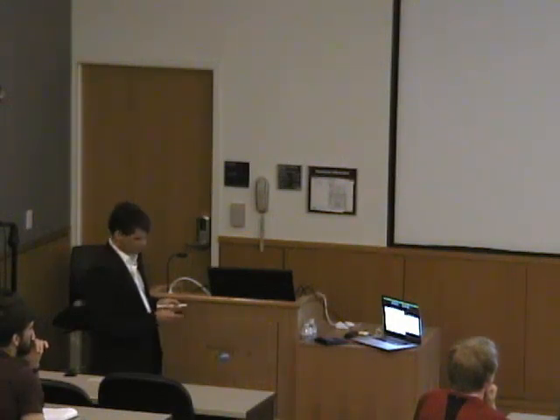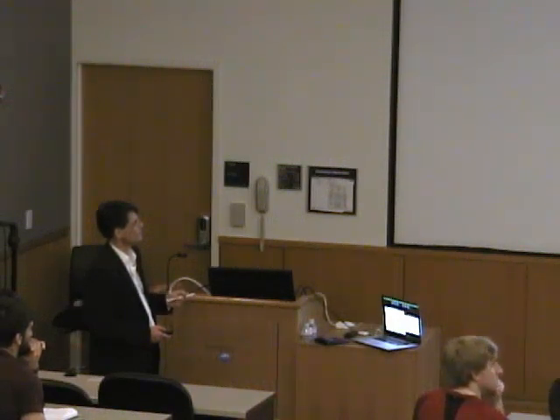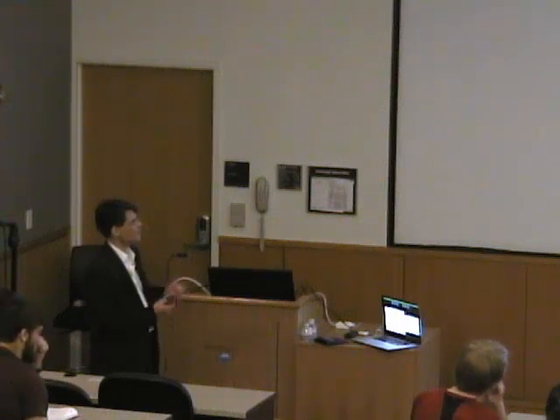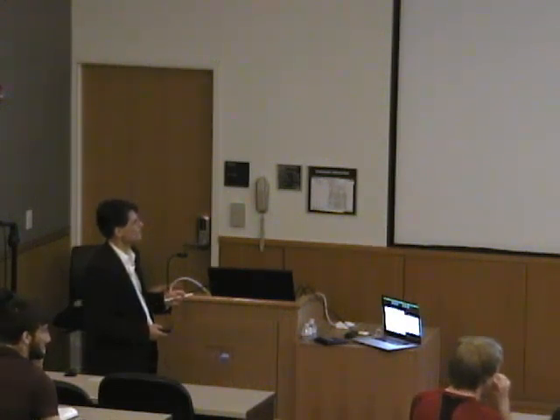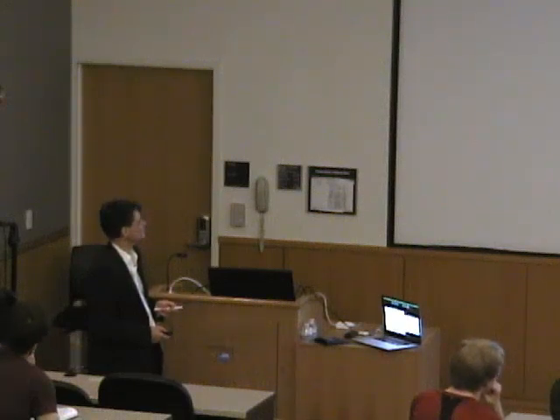And there is a second class of MCD spectra, where the MCD spectra dominantly consist of opposite signs. In this case, there is dominant spin-orbit coupling in the excited states of the system that gives rise to the MCD intensity. In order to understand that, we would need to go deeper into the theory, which I'm not going to do today, certainly because eventually I will run out of time here.